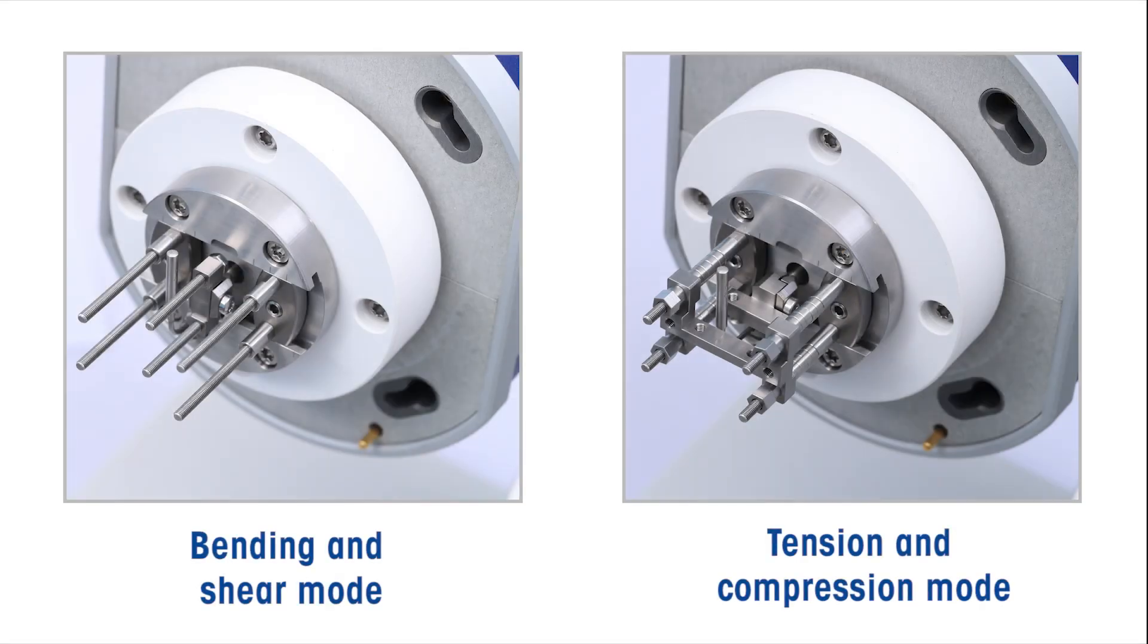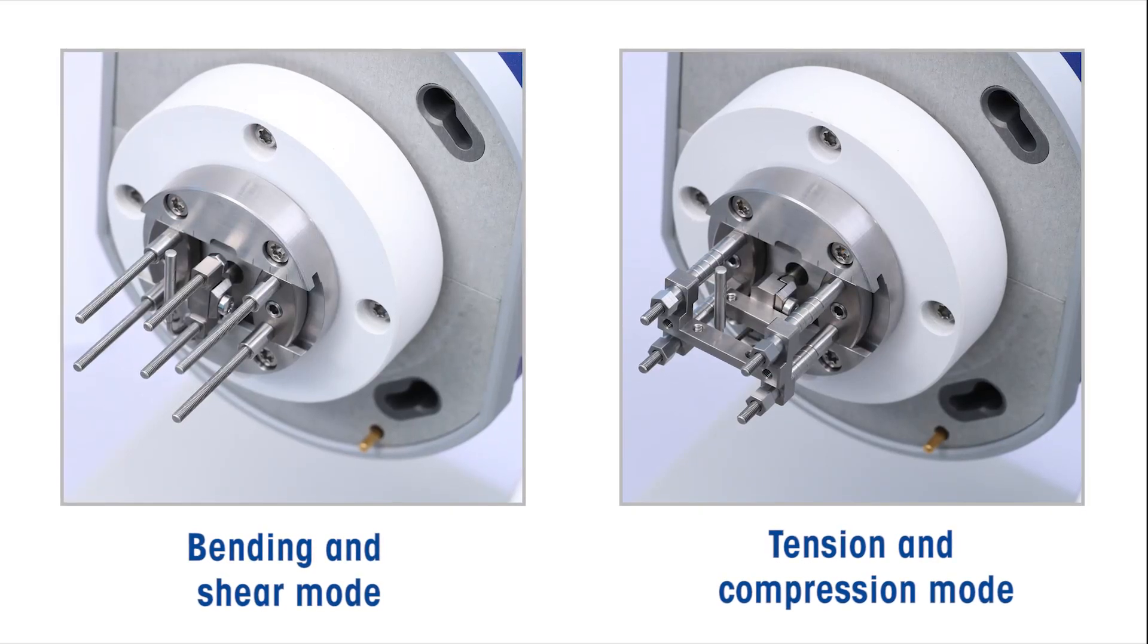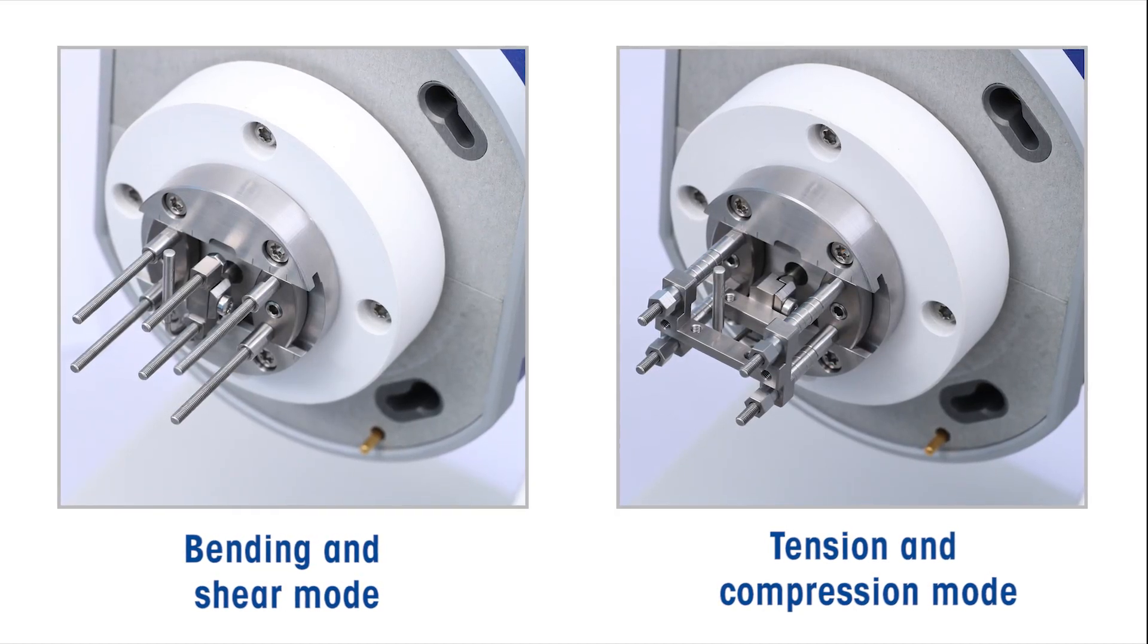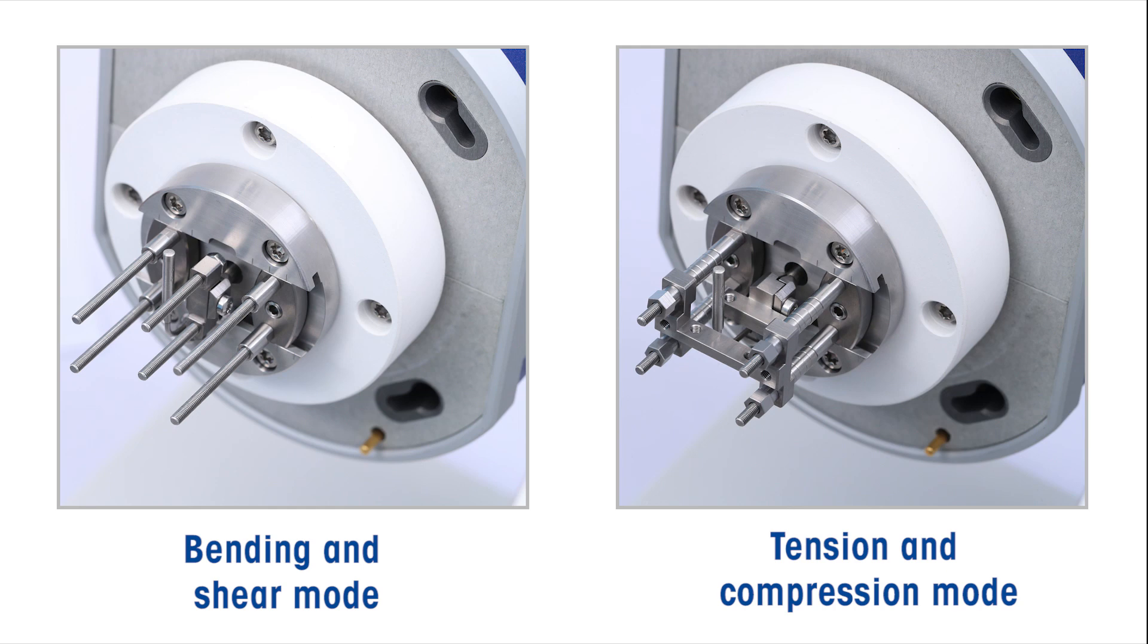Next, we will show you how to switch between bending or shear drive shaft clamps and tension or compression drive shaft clamps.